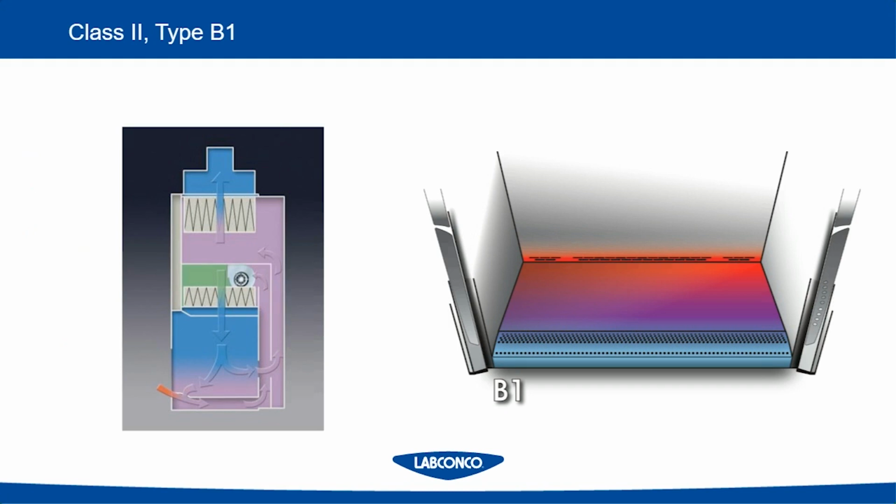From the side view, you can see a little bit about how this cabinet works. Inflow air still comes in the front, as denoted by the orange arrow, and the air passes underneath the work surface. However, you notice in the back, there's a little bit of a split plenum. So depending on where the airflow is going out, coming from the front or the back, depends on if it takes the exhaust pathway or if it's circulated back around into the supply pathway.